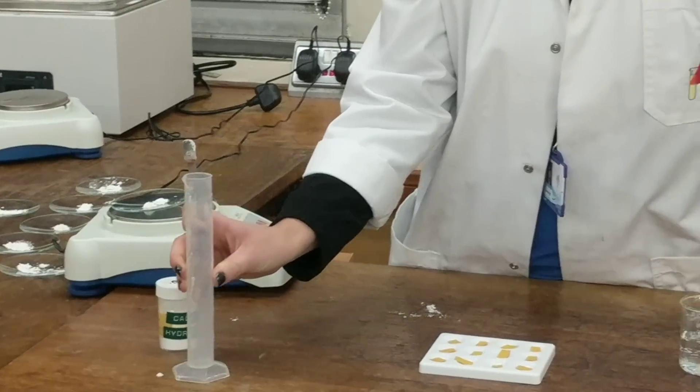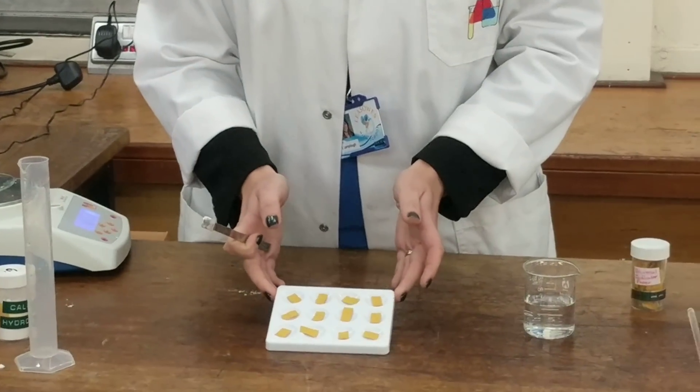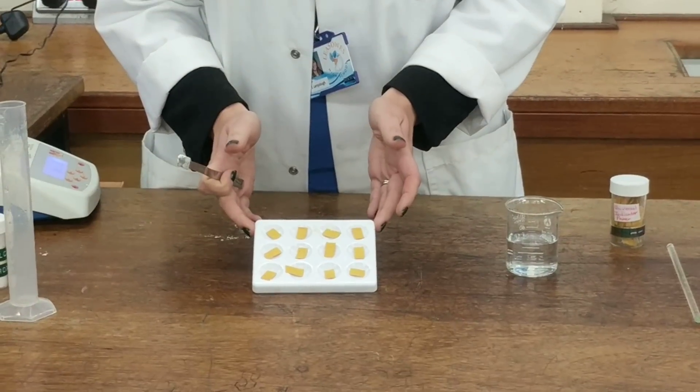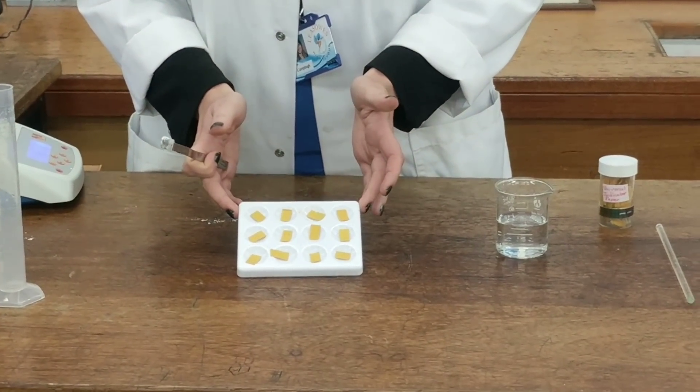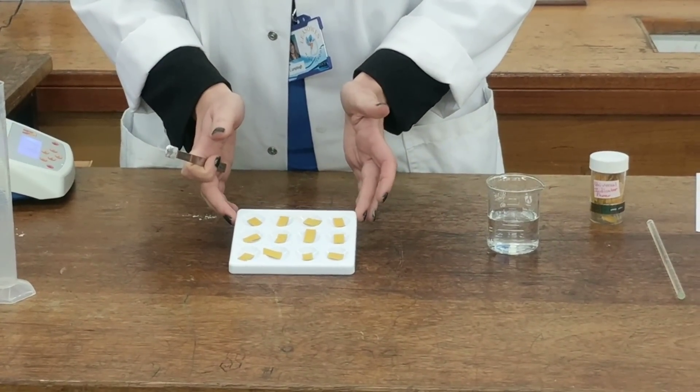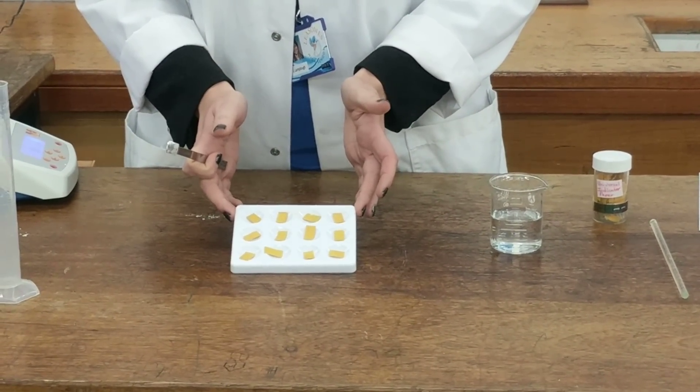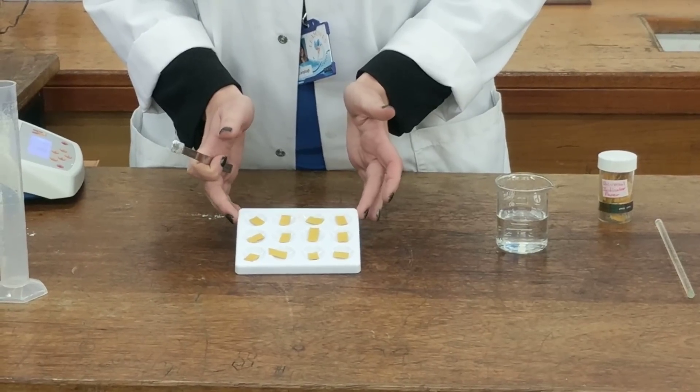We've got set up here a spotting tile with a piece of universal indicator in each well. This will be able to tell us whether the solution is an acid, an alkali and when indeed it has neutralised.